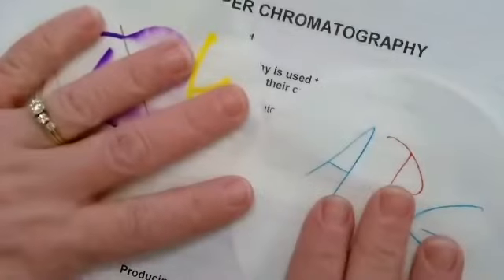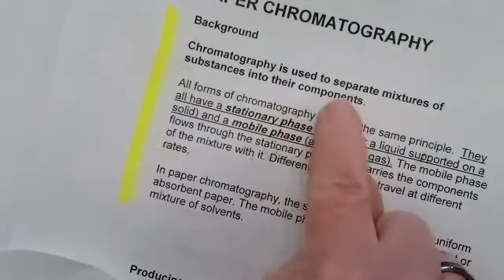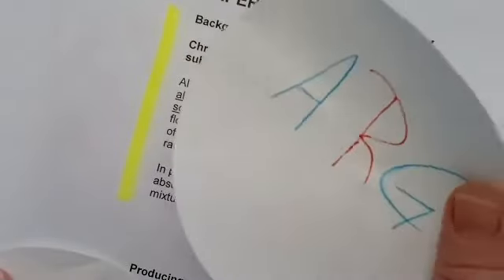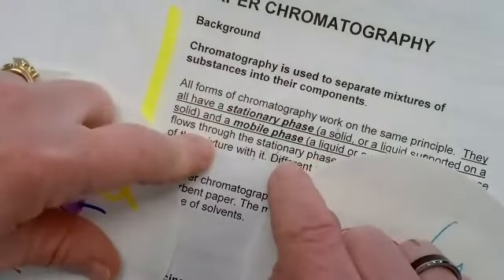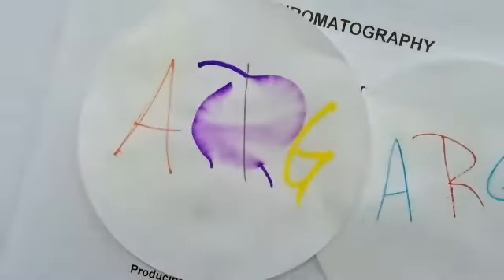All right, so yesterday you did this. We are trying to investigate, are there separate parts in the mixture? And we can't really pour them through a filter or pick them out with forceps. So let's try chromatography. And chromatography, Logan, separates using a stationary and a mobile phase. So yesterday's adventure, what was the stationary and the mobile phase?